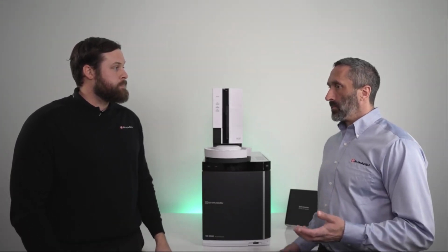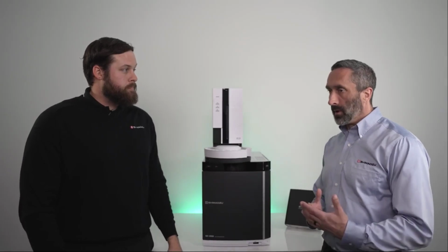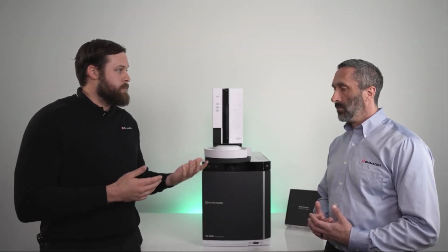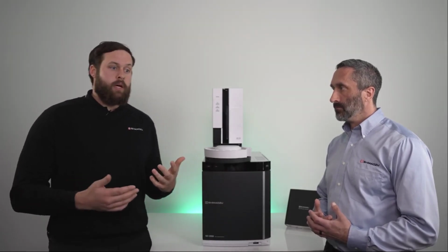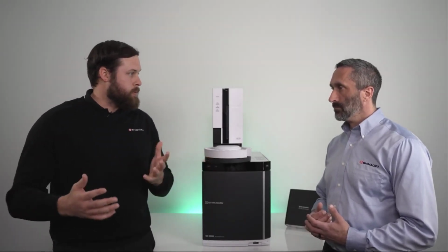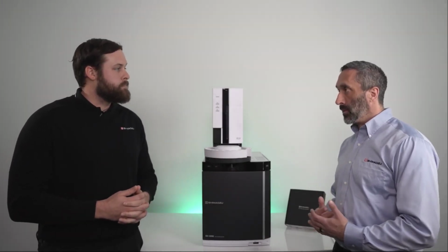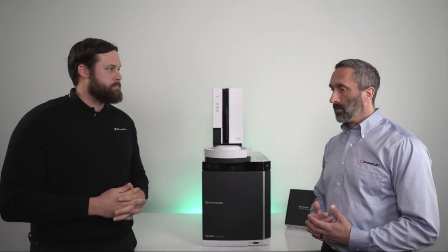So what does this do for the supply chain in terms of lead time and the ability to deliver it? It sounds like it probably streamlines the production process to have one power supply. Yeah, absolutely. So not only have we streamlined the one power supply, but all the additional SPL detectors, things like that that will eventually go on this, also have that universal power supply. So we have the ability to mainly focus on one unit and just change the power supply if need be. So that should hopefully also alleviate some of the power supply and supply chain issues that we've obviously been facing over the past couple of years. Yeah, especially since COVID, that's been a big deal, trying to get instruments to the customers as quickly as possible. Yeah, of course. That's great.